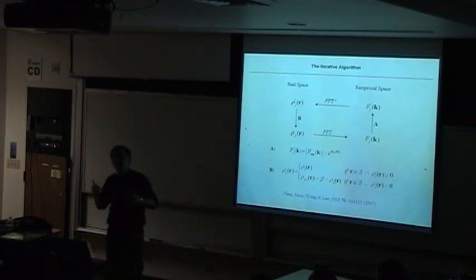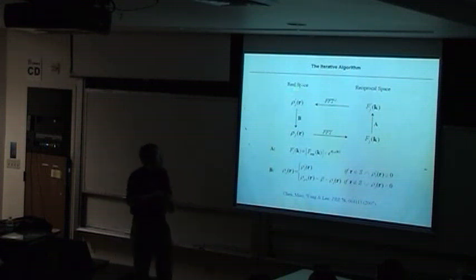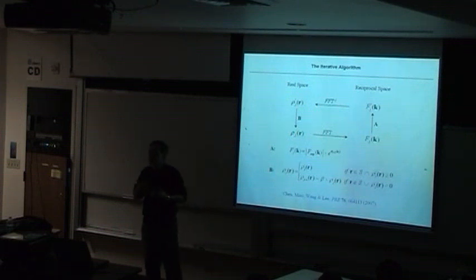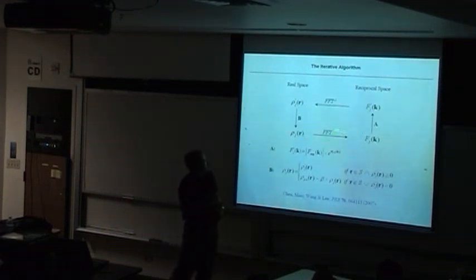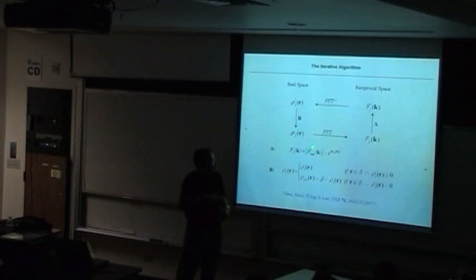And they use many constraints, histogram matching and positivity. So this is another way that physical constraints can be used, because some information is already known, right? And then we get a new electron density, apply fast Fourier transform, and get a Fourier transform. Every time you update the phase information, you always use the measured data.